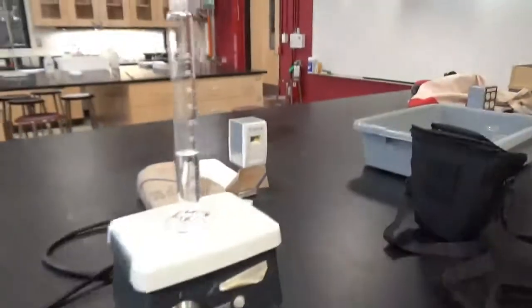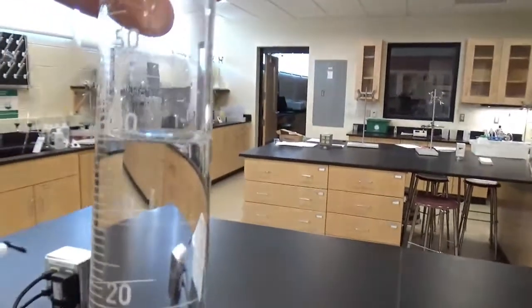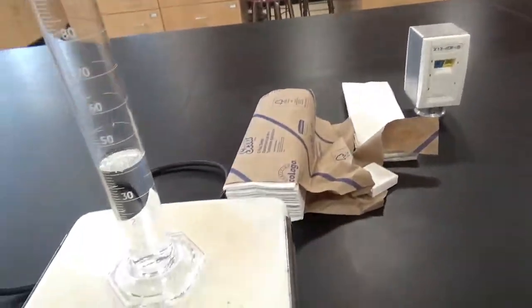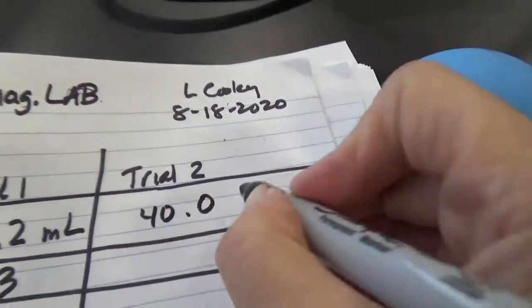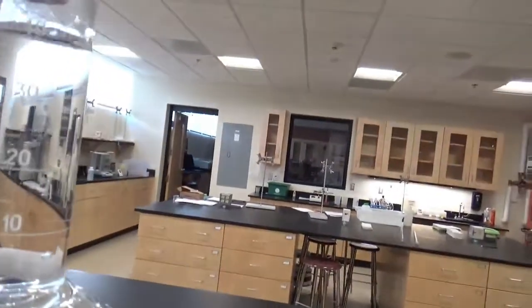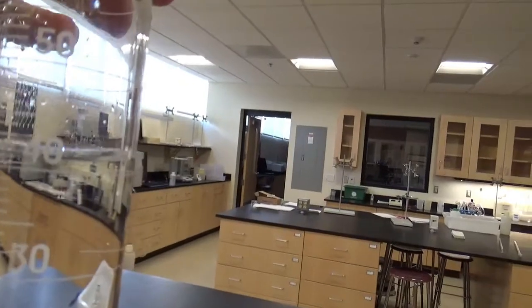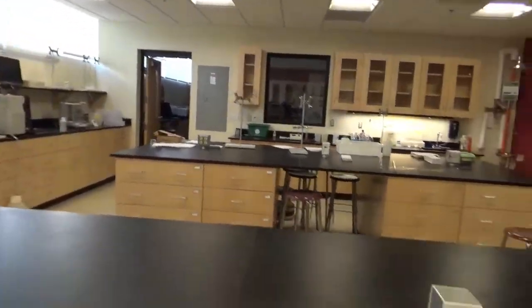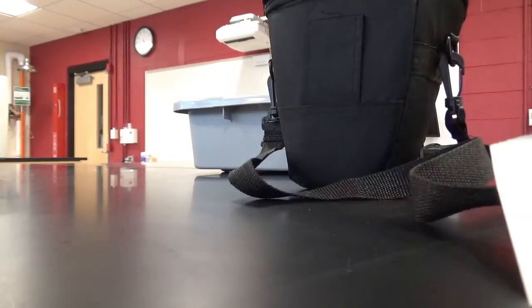And in this other graduated cylinder, I pipetted 40 milliliters of water. When I read this one close up, I thought that it was just about at 40.0 milliliters of water. Now I'm going to dump the stir bar in there as well and check the volume again. You probably can't see the volume very well here. I just can't do it at the same time. So let's see what I think it is. 41.2. 41.2 with the stir bar.